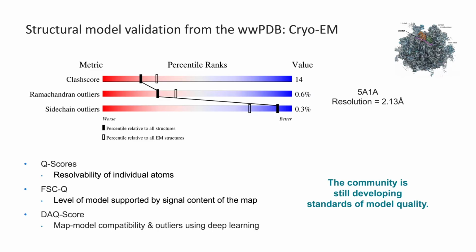There are a set of different criteria to match atomic coordinates to the Cryo-EM data. The community is still converging on the best criterion. I expect the WWPDB to add a global data fit quality measure in the next few months.